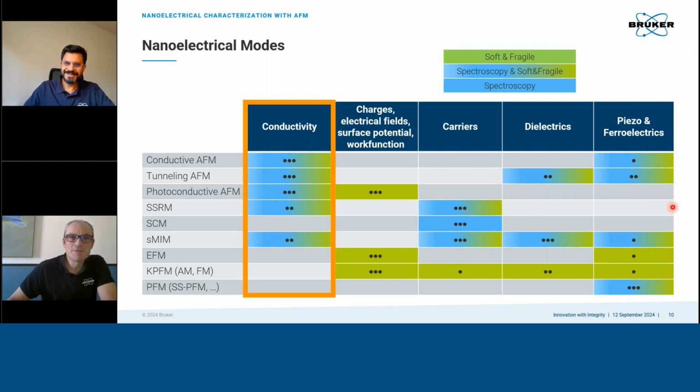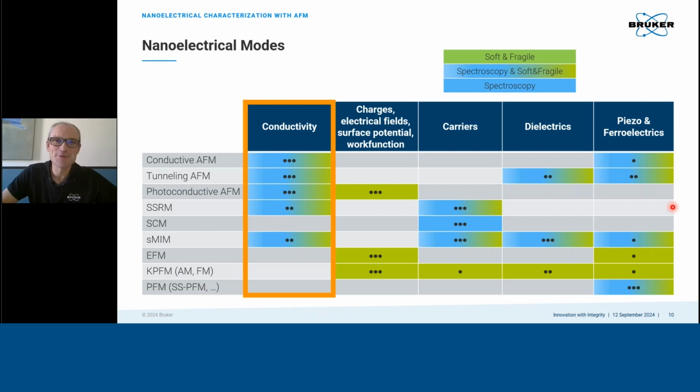Thanks, Khaled. Always a pleasure to do a joint webinar with you. I'll focus on the first property category, which is conductivity. And as we go through the webinar, we'll also address the other columns with examples and go a little bit into detail on how it works.